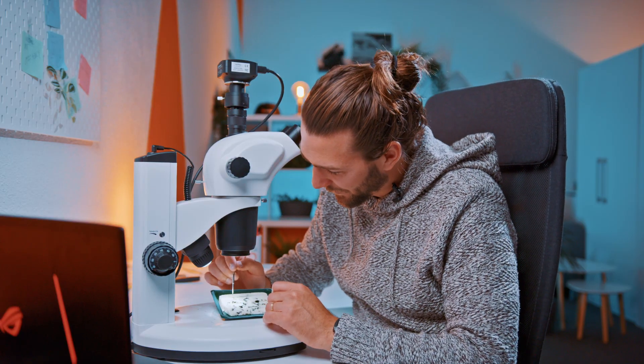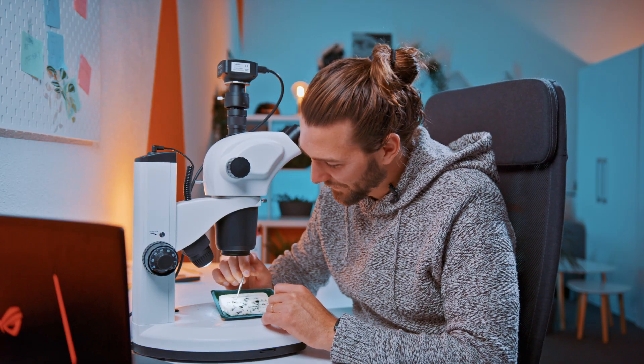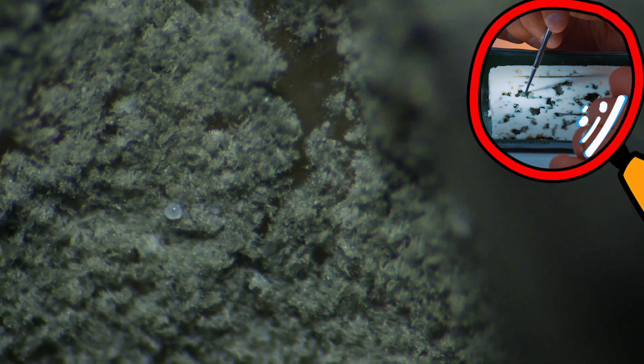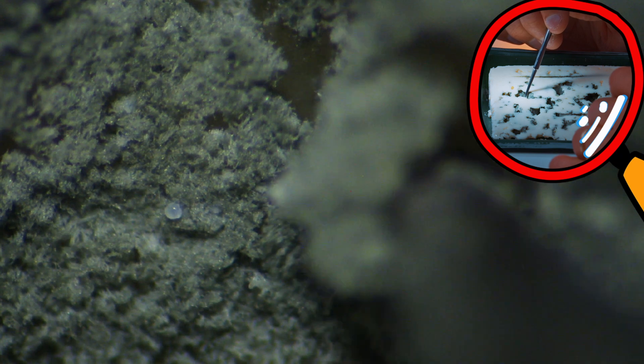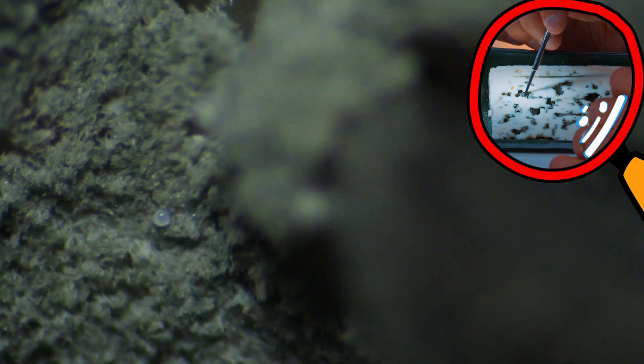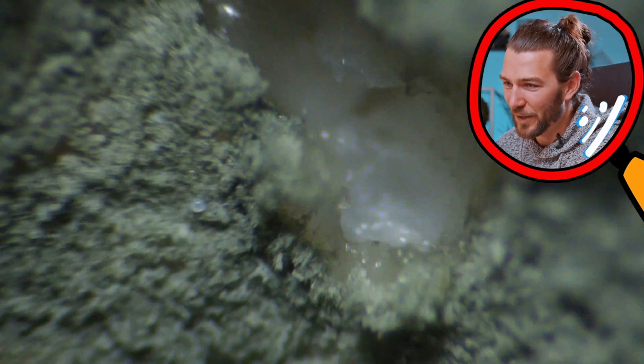Maybe if I take here my little poking stick, you can see how large this tip is compared to the little ball here. You can see how... okay, I'm damaging it. If I zoom out a bit, you can see what's happening. Let me poke it up a little bit more.